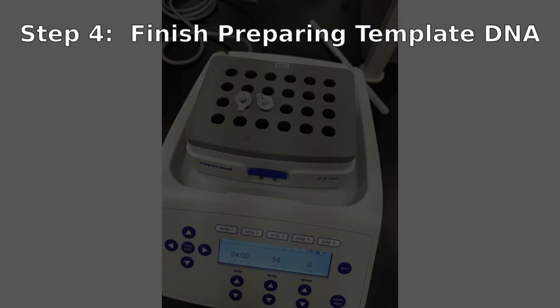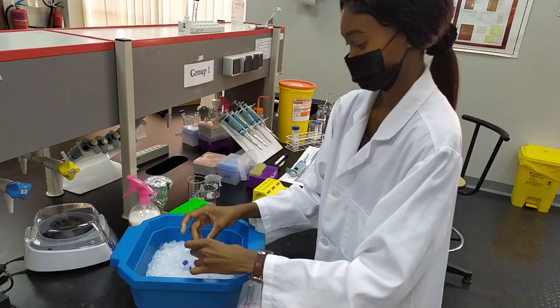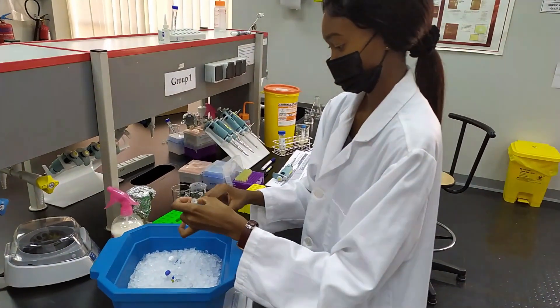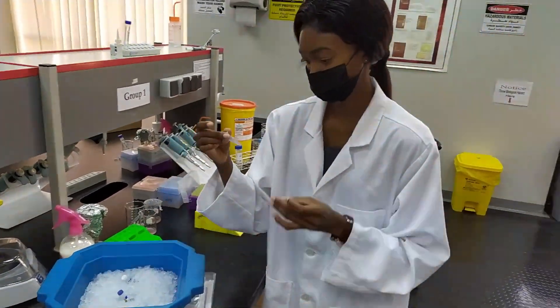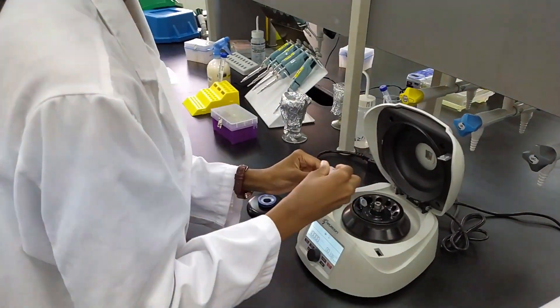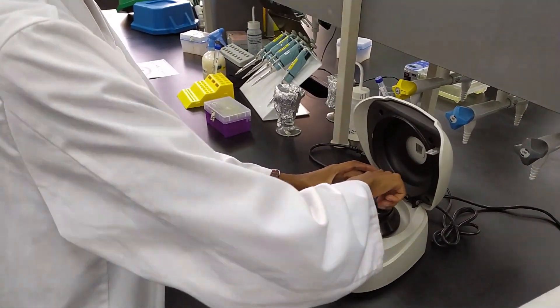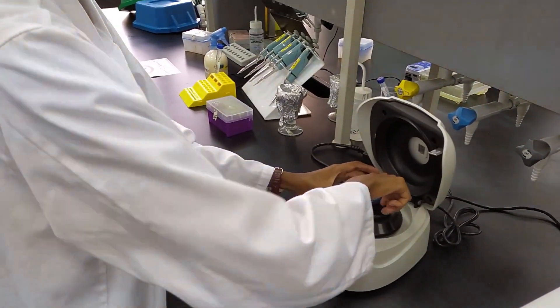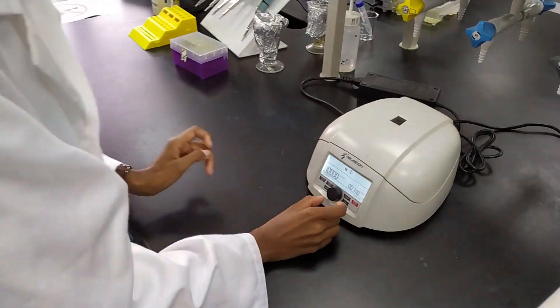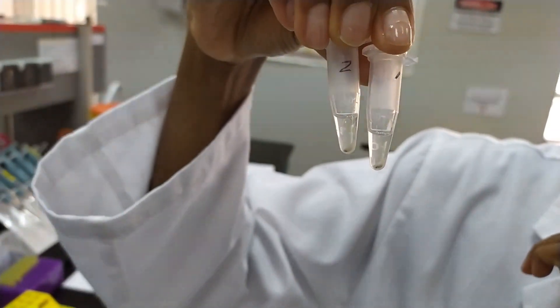Once your master mix is ready, you can go back to your heating block and retrieve your samples. Keep in mind that any time you heat samples at high heat for any length of time, some of the liquid in your tube will evaporate and it will be in the vapor phase. Whenever you are doing any kind of heating, the next step should be to put your tubes back on ice. This will allow all the liquid to condense and settle on the sides of the tubes. After this, you will spin your test tubes down to collect all the liquid, and it will also help to separate the supernatant, which will contain the plasmid DNA, from the rest of the lysed cell components. Once you have completed your centrifugation, you are ready to set up your PCR.